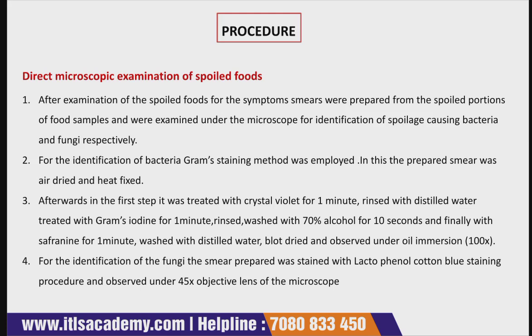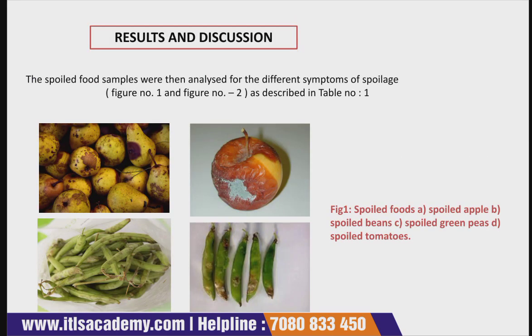This is the case with bacteria. Then comes the identification of fungi. For the identification of fungi, the prepared smear was stained with the lactophenol cotton blue staining procedure and observed under the 45x lens of the microscope. So after the procedure, the result is shown here.